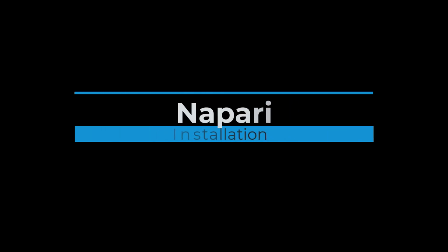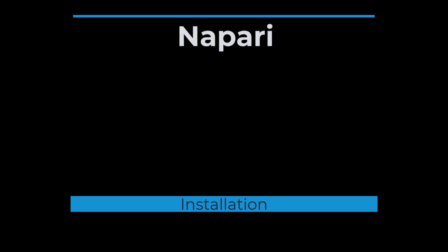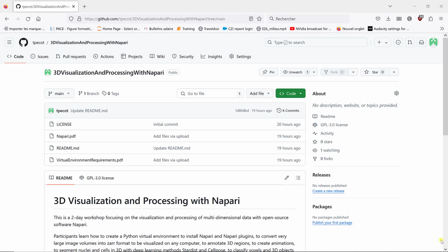In this video, I'm going to show you how you can install the virtual environment that is required to do the Napari workshop. A virtual environment is a very important concept when you use Python code, because you rely on Python packages, Python libraries, and you have different versions of a given package.